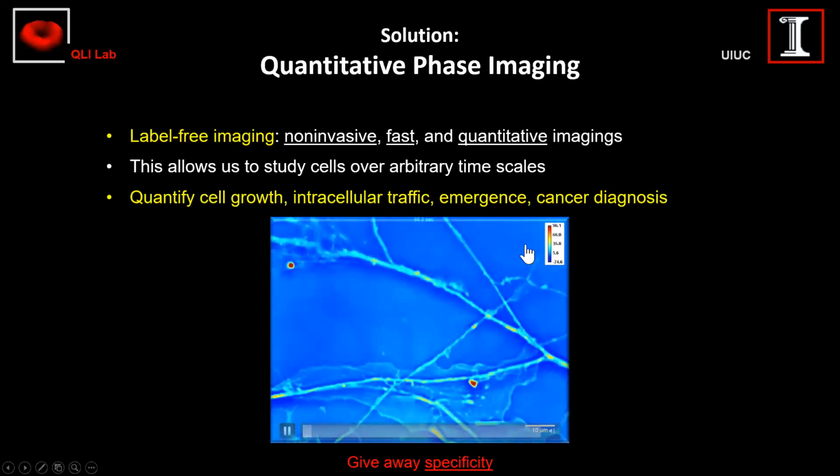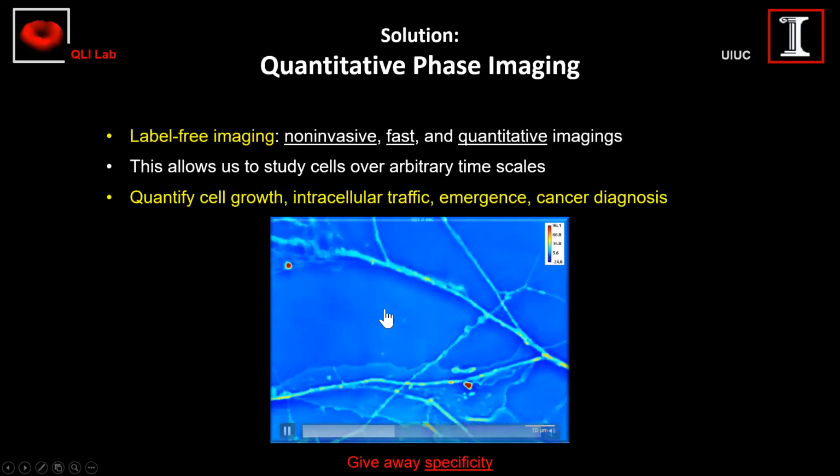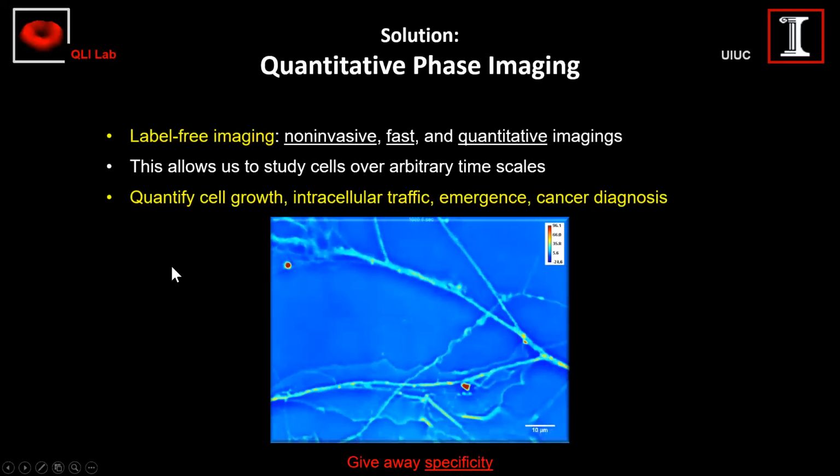You can convert this optical parameter, the phase delay, into something like the density of the cell, and therefore connect to something biologically relevant: how cells grow, how they produce mass, proteins, lipids, and so on. So it is non-destructive, there is no photobleaching, very low phototoxicity, and on top of that, we can quantify these biophysical properties like it wasn't possible before.